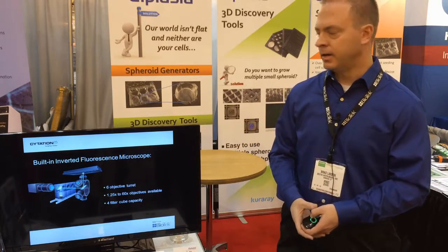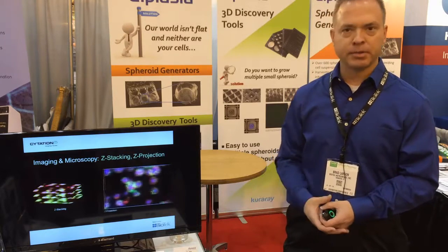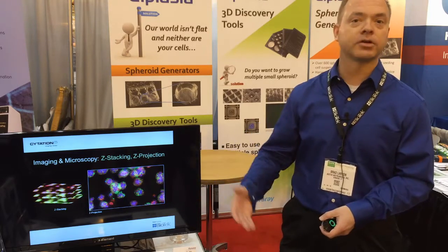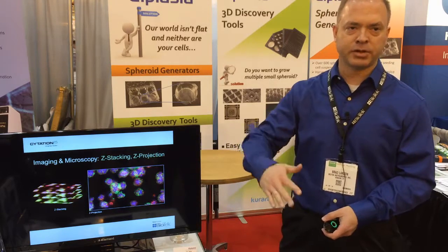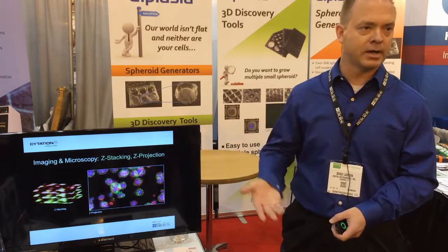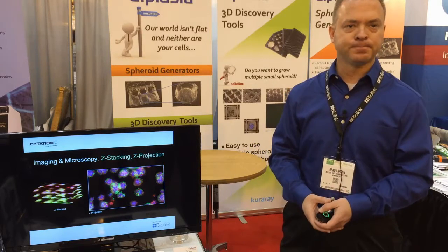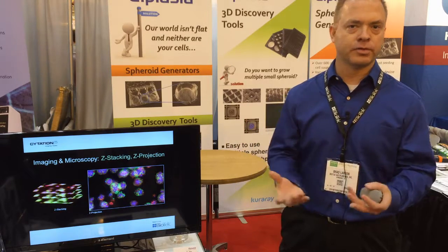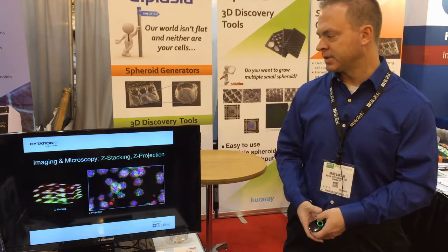The software provides additional capabilities. For 3D cell culture, you can perform z-stacking to capture images in multiple z-planes, and then perform a z-projection. Since this is wide-field microscopy, the z-projection applies different algorithms to give you a crisper final image that provides better analysis capabilities.